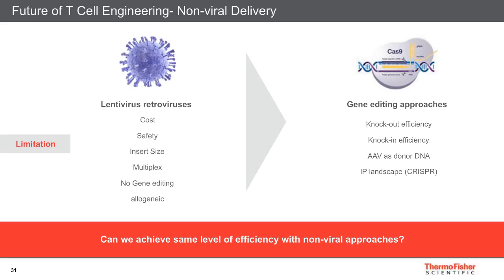One of the limitations of lentivirus, like we mentioned here, is the cost. And we try to reduce this with a better system like LV-MAX. Then safety: because the lenti incorporates the DNA inside the genome, there's concern that that DNA can incorporate into an existing gene and change the function of the cell. We could have a dramatic effect. There's a limitation around the insert size. There's a limit on the size you can put into the lentivirus to incorporate, and as we see, this field is moving toward more complex systems, more subtle regulation of the chimeric antigen, and so that may be a limitation there. Most importantly, you cannot do gene editing.